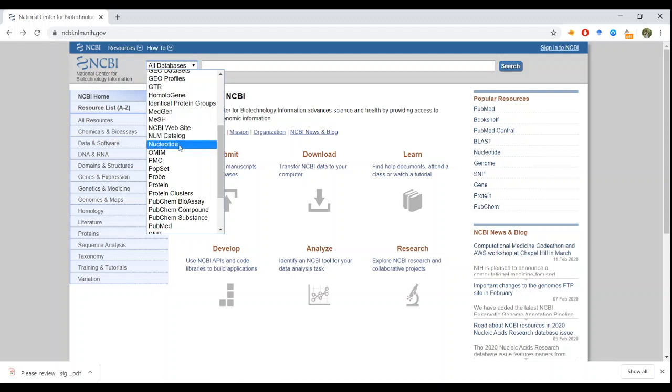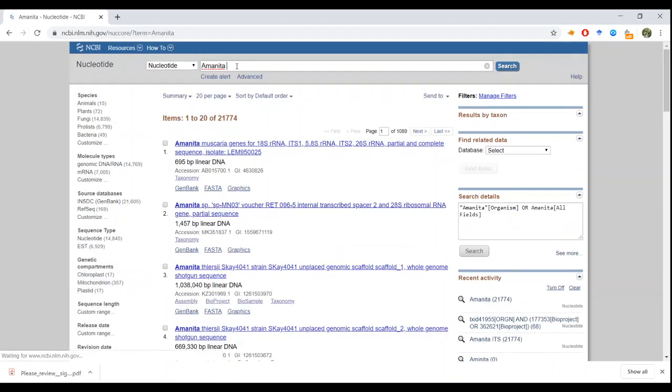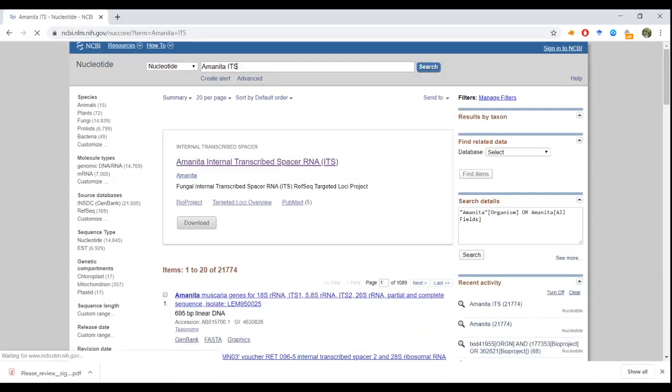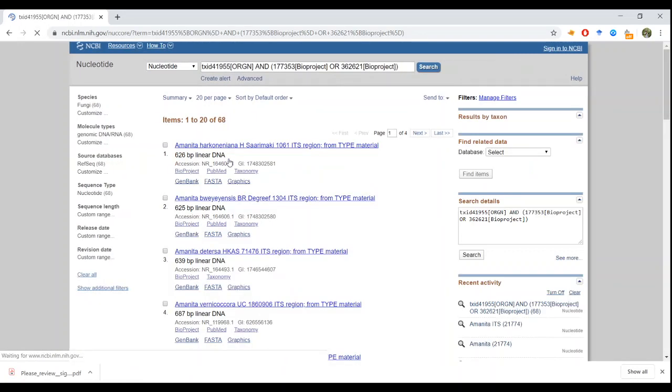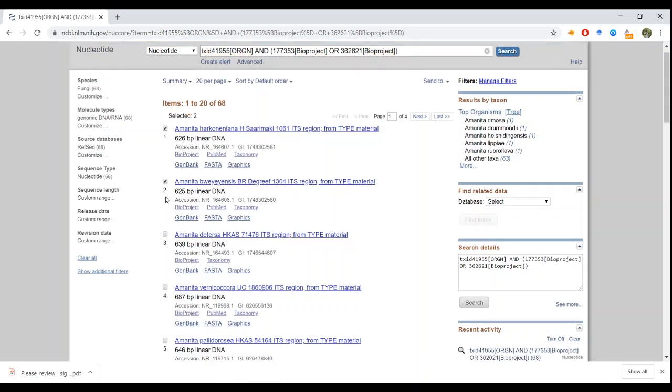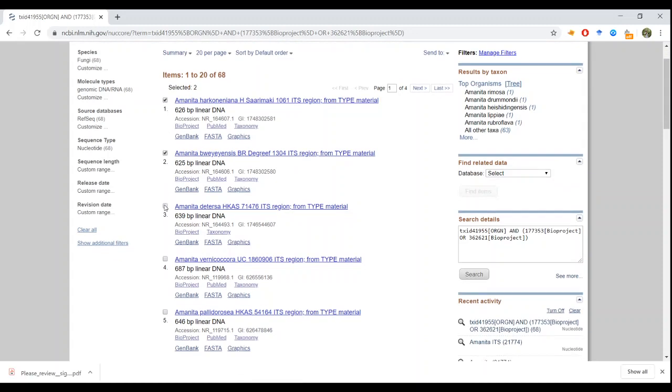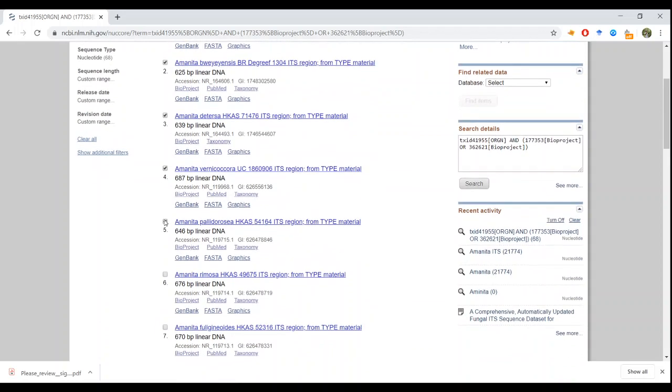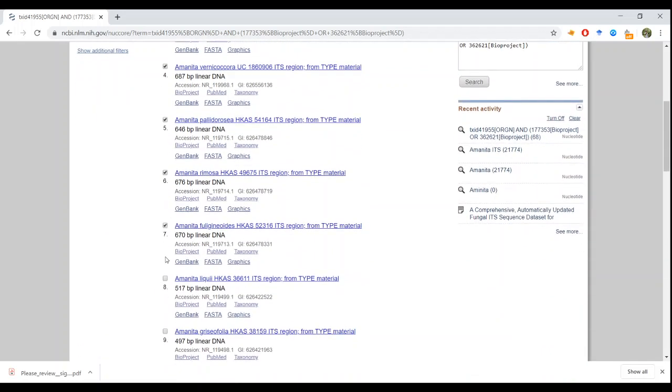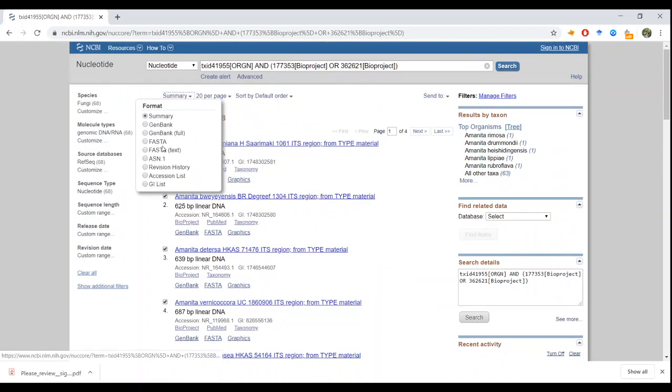The first thing we're going to do is go to nucleotide in the NCBI database, and I'll use Amanita since it's one that I'm familiar with. And actually add ITS. So what you want to do to get the sequences, just tick mark these boxes. Tick mark, tick mark. For this I'll just use 10.